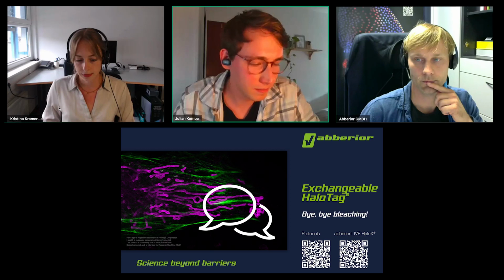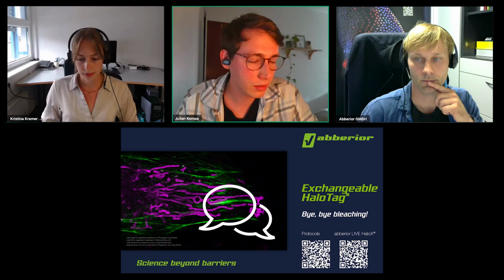Yeah, sure. I wanted to highlight that exchangeable probes can be beneficial for some applications, but of course, having a covalent labeling is still very powerful, for example, for pulse chase experiments, for post-hoc analysis. And one thing you have to keep in mind is that we added this bleaching resistance, but we kind of bring the burden to do no-wash imaging. So the fluorophore has to be always present. You cannot wash. This is possible due to the fluorogenicity of the probes, but there will also be some background.